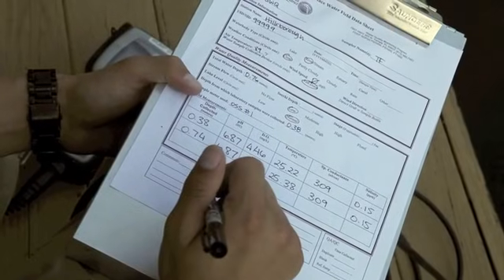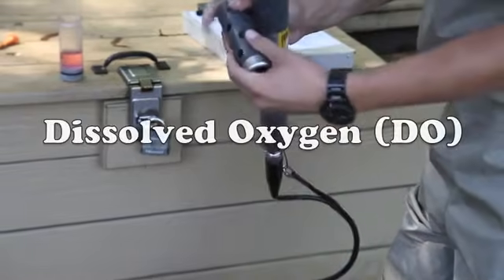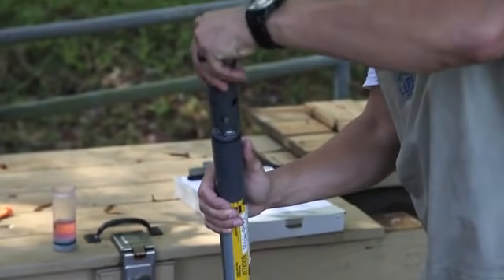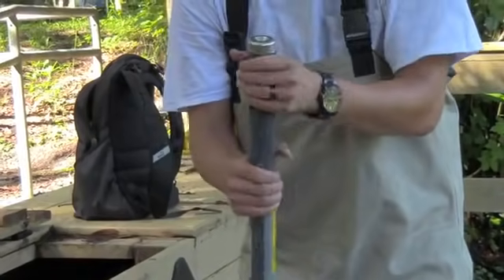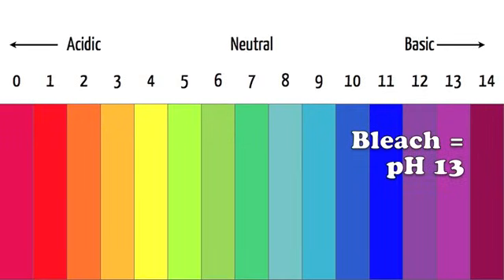Other parameters scientists measure are pH, temperature, and dissolved oxygen. This sonde is a device that measures all three parameters. The potential of hydrogen, also known as pH, is a measure of acidity, and it ranges from 0, extremely acidic, to 14, extremely basic, with pure water right in the middle at 7.